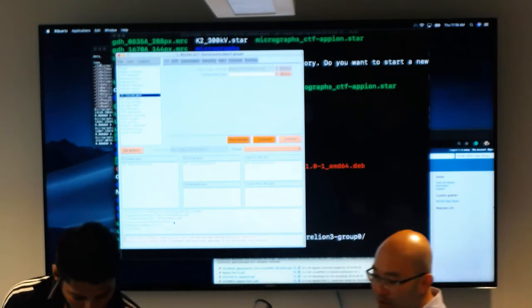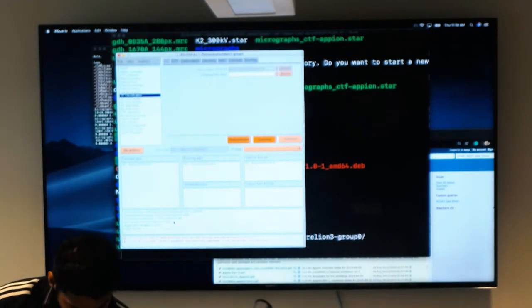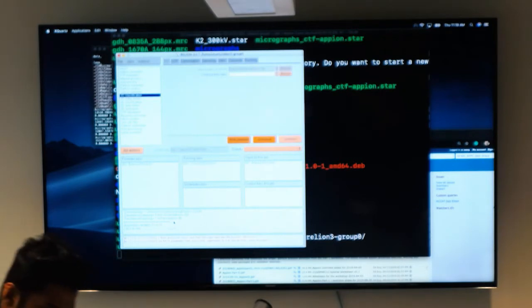That's why we also have a spare IP. It's the number 5. So now you understand we have to get the environment linked very well. So sometimes these instances don't show. What's your problem? What's going on? Well, let's see. Your file's not there. That's correct.